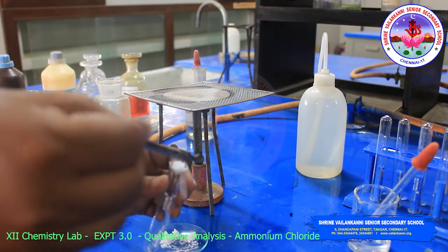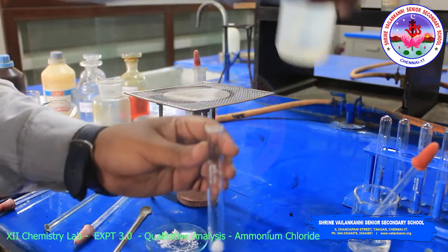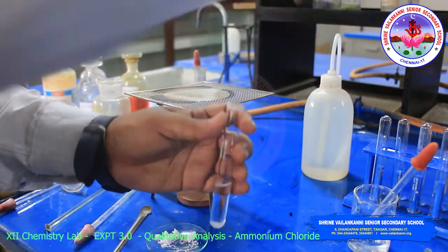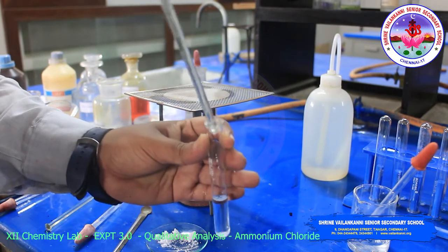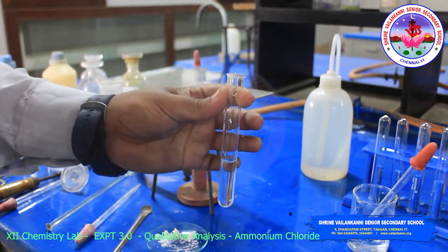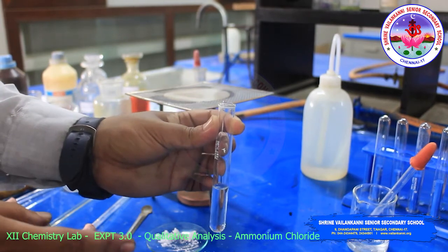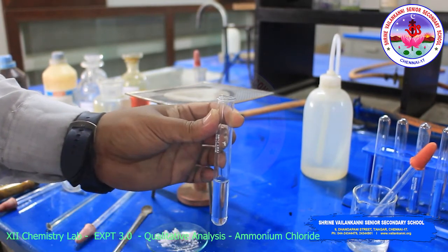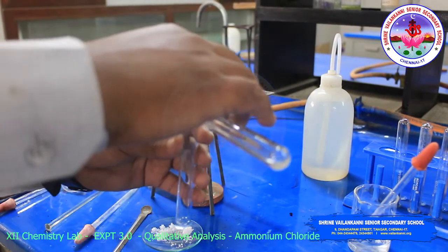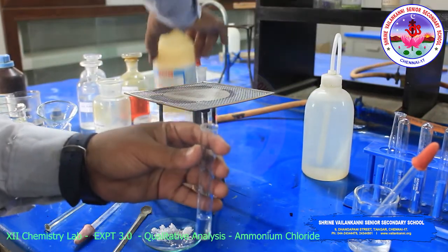Take the substance and add distilled water, dissolve it using a glass rod, until the substance completely dissolves. So this is the original solution. With this original solution we are going to perform the basic radical test. Take a small amount of original solution, then add Nessler's reagent.